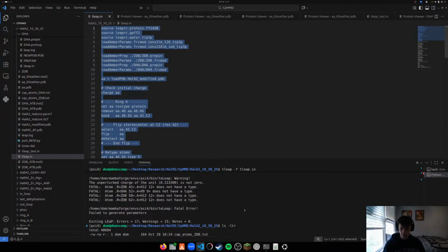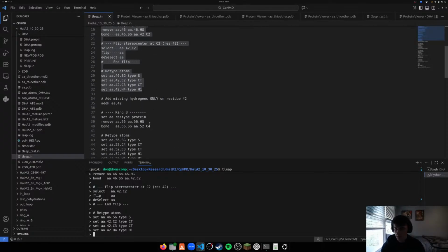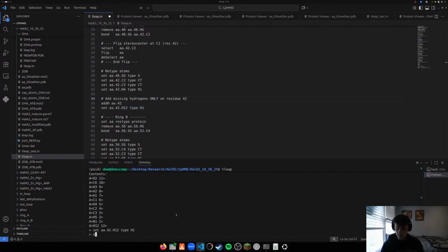So let's do this. And then does this work? Does. So do DESC. So now I have an H12. So maybe we'll do, okay, that seems to work.